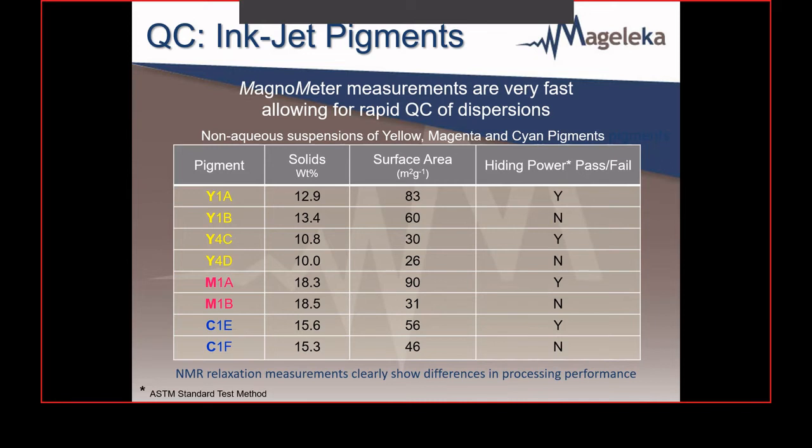For any suspension, the relaxation time decreases with increase in concentration. They're not quite the same because of the solids content they gave me, so I normalized all the data to take account of concentration. Each set comprised batches that had been subjected to the same processing, but were formulated simply with different polymeric dispersing aids. For each pigment pair, A and B, C and D, etc., 2 different polymers were used, one for A and a different one for B.